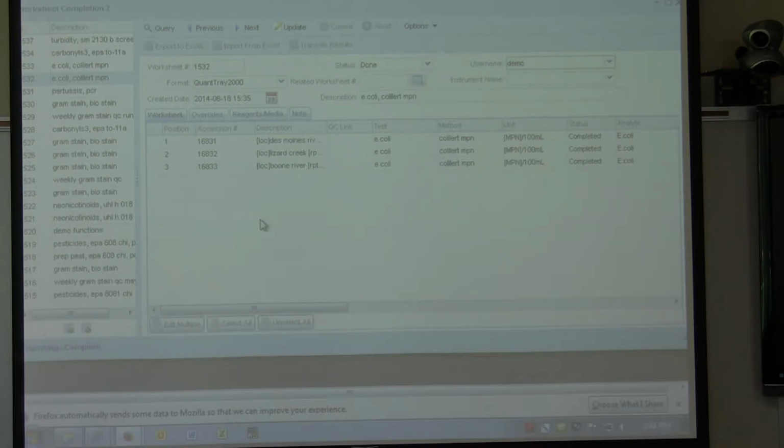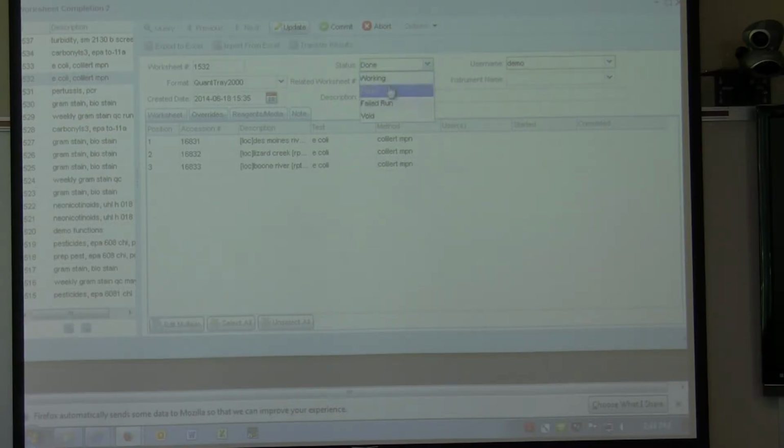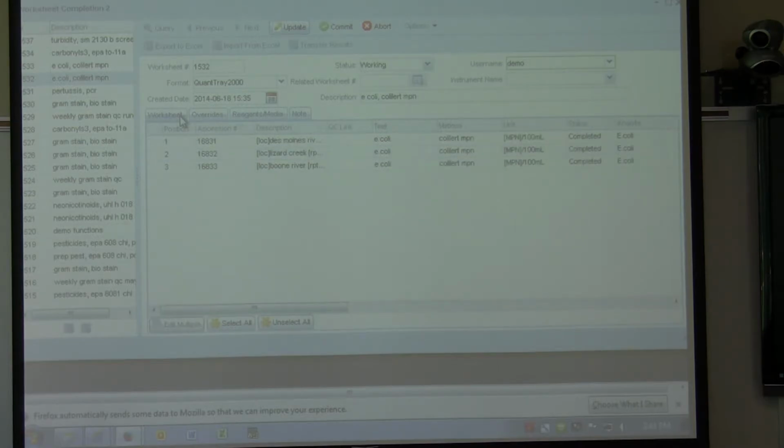Did you ever go into the override section? Very, very glancingly. So here, yeah, you can do just as before you did, so up these. No, it's released, or they have results on it. They're completed. Shouldn't matter.